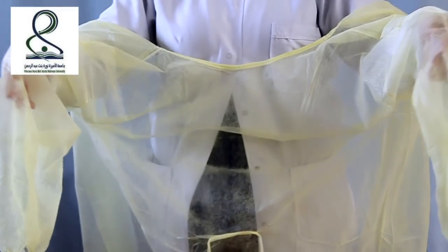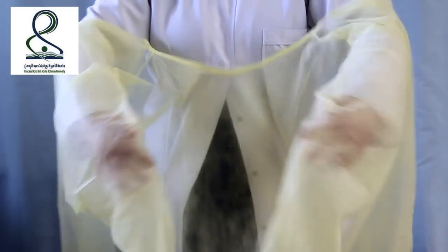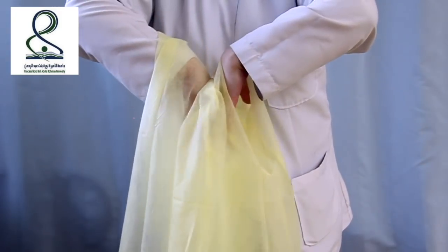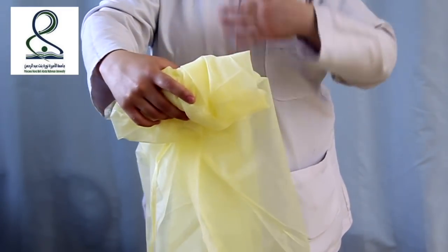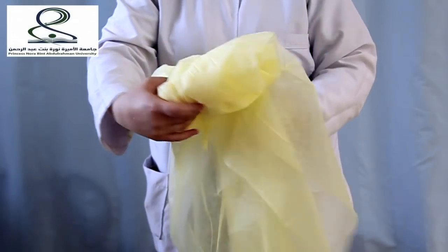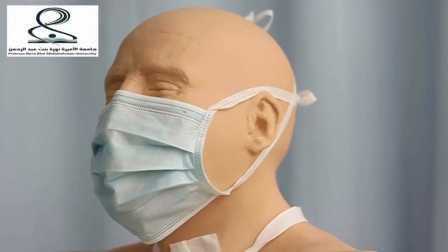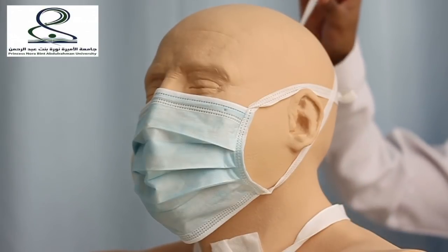Make sure the gown doesn't touch the body. Remove goggles. To remove the mask, start with the lower part and untie it.